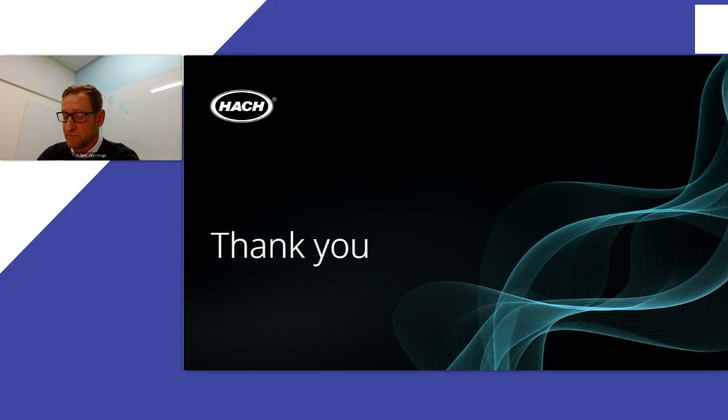It's not impossible. There could be someone out there, because many states now have what's called primacy, and so many states are running their own NPDES permit compliance. The reality is that there are lab approved methodologies that, even though we're using a similar technology like ISE, for example, so an ion selective electrode in the lab could be certified for regulatory reporting, but an ion selective measurement in a probe in the field is not typically approved.